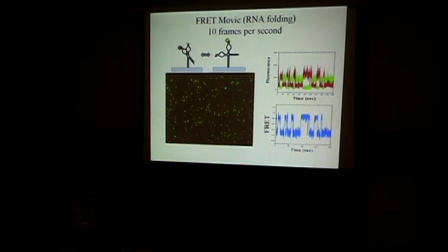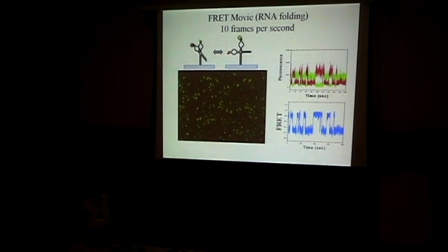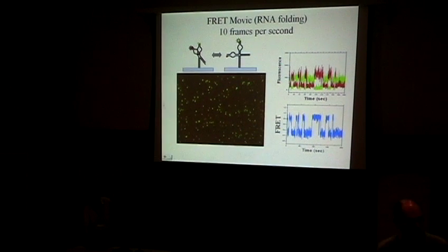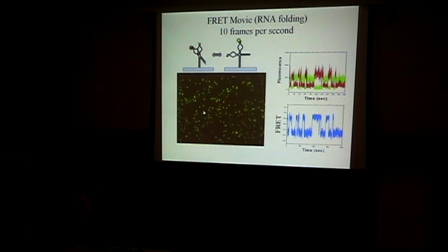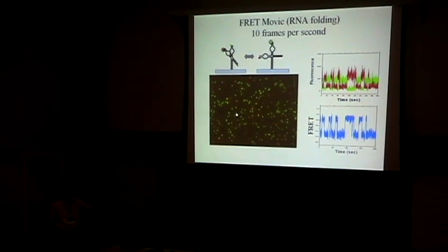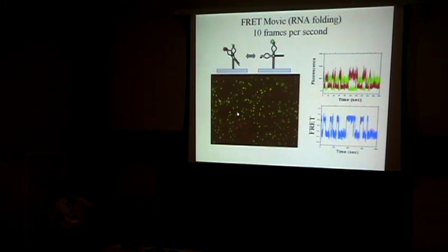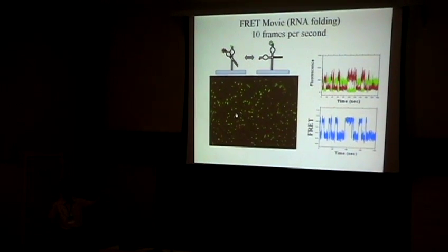Yes. I see that the red is oscillating differently from point to point. They have different time cycles. Yes, I think that's a very good point. In fact, when I show this movie, there are some molecules that flick on and off fairly rapidly, so I point at that molecule because it is very easy to illustrate the FRET dynamics.